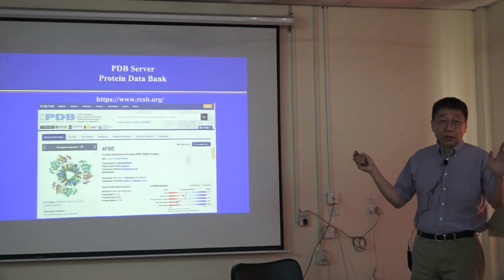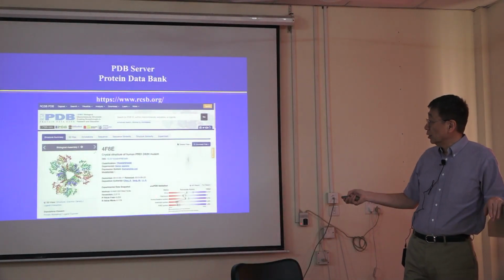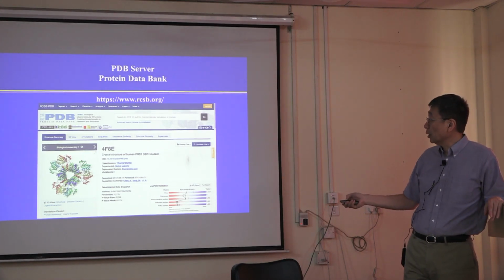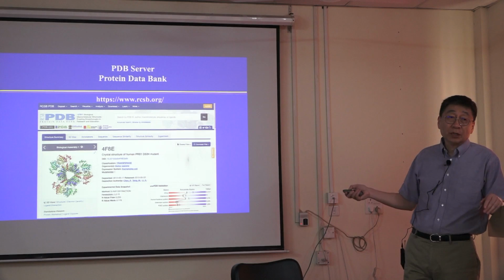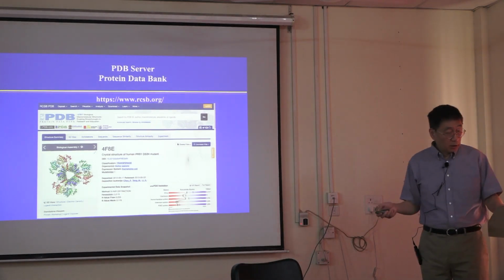So PDB, you all know, so I won't spend much time talking about it. This was already explained. Okay? Resolution is somewhere here. So for each structure in the PDB, you can see the resolution of that structure.